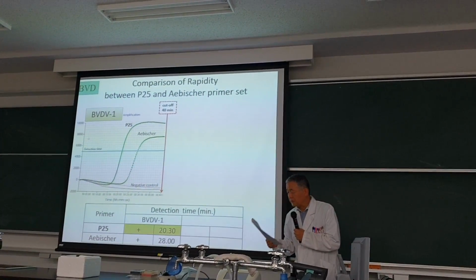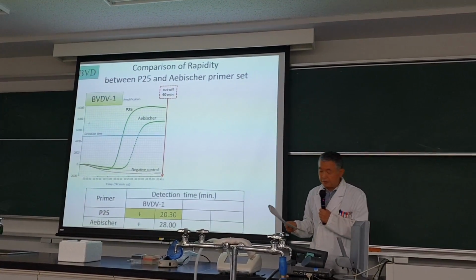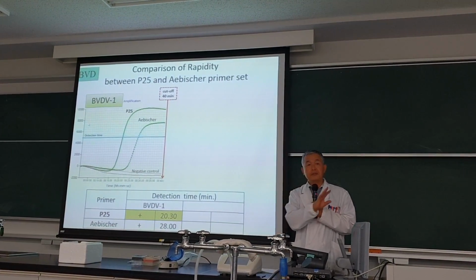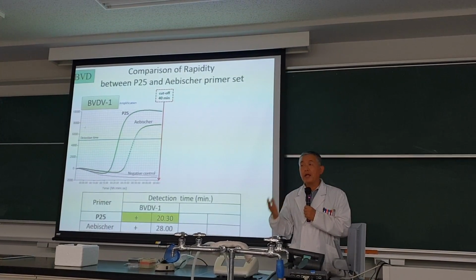First practical is the subtyping of avian influenza. H5, H7 is important. We have to discriminate those influenza H5, H7 or others.